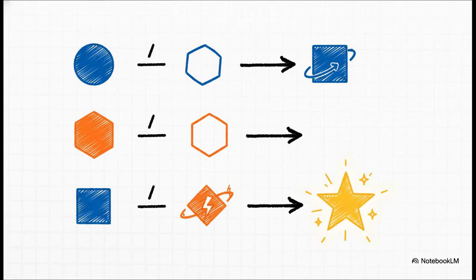So how do we actually do the math? It's just a ratio of ratios, and it sounds way more complicated than it is. First, let's look at our protein of interest. We'll divide the treatment value, 4,500, by the control value, 9,200. That gives us about 0.49. Okay, now we do the exact same thing for actin. 8,350 divided by 8,500 gives us about 0.98. The final step, we just divide that first number by the second number. So 0.49 divided by 0.98. This little calculation magically cancels out that loading error, giving us the true normalized value.